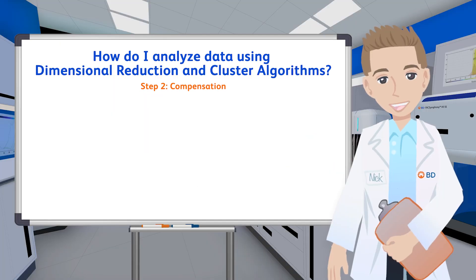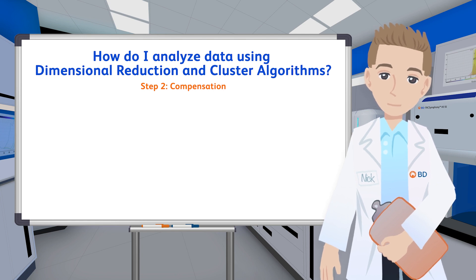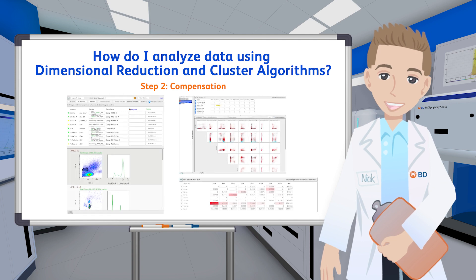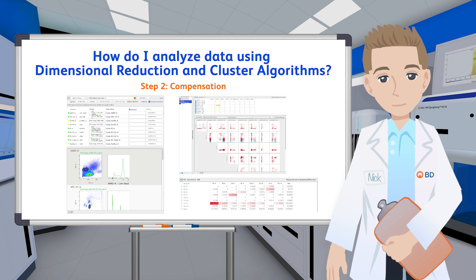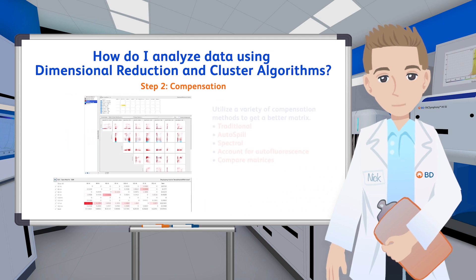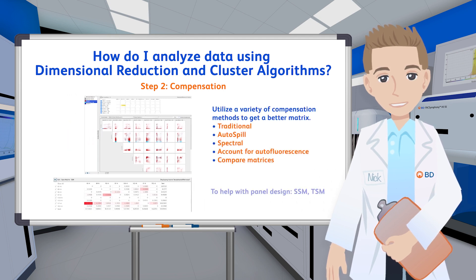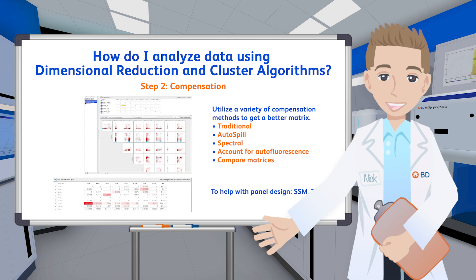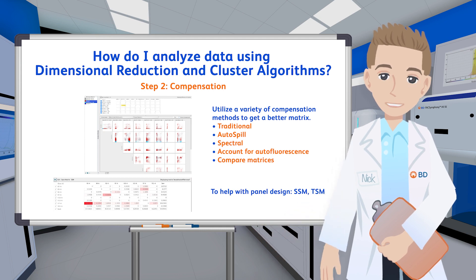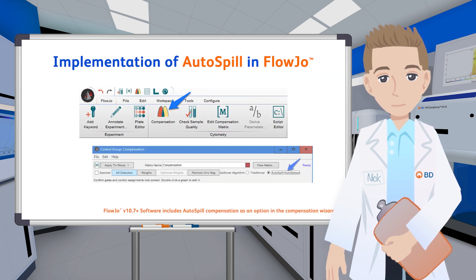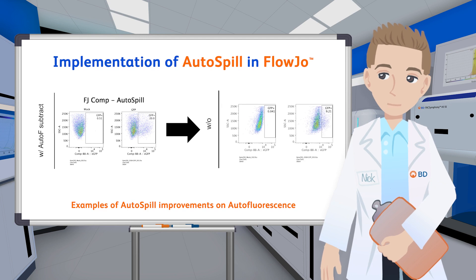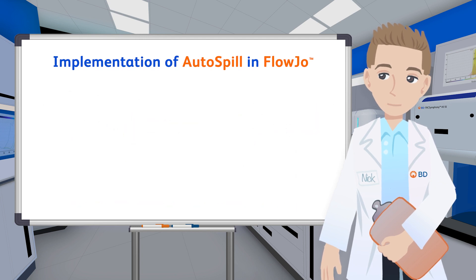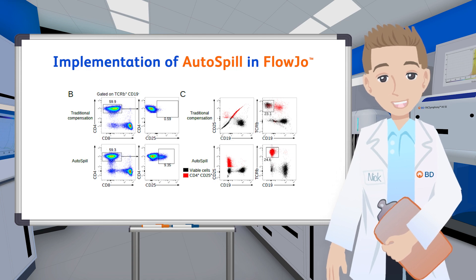The second step is Compensation — it is absolutely key to any high-dimensional analysis. As we add more markers, the complexity of our panel threatens to become unwieldy. The Compensation platform built into FlowJo is quite flexible, permitting spectral unmixing with or without a whitening channel. You can also choose between the traditional method of compensation or using the newer AutoSpill/AutoSpread method. The AutoSpill method has the advantage of being able to subtract out autofluorescence. You can even compare matrices using various methods to determine which works best.